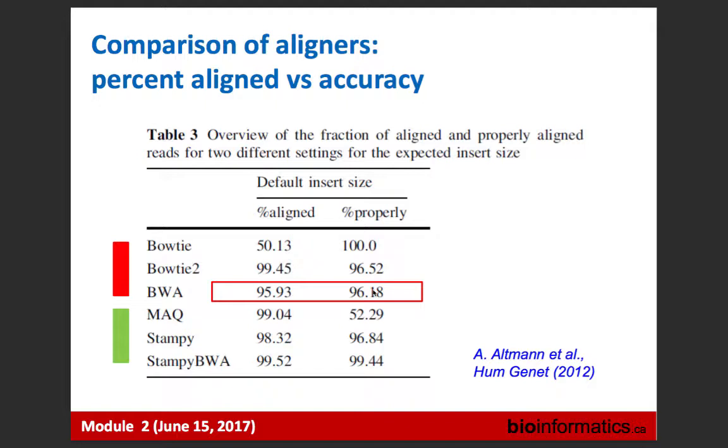Yes. So if I have a FASTQ file and I align it and the alignment percentage is 80% or 78%. So if it's less than what percent can I say that my data don't have accurate depth? If I understand your question correctly, you're asking whether 80% is good or not? Well, there is no universal answer to this question. In the first ChIP-seq experiments, the alignment rate was ridiculously low. It was 10%, 15%.